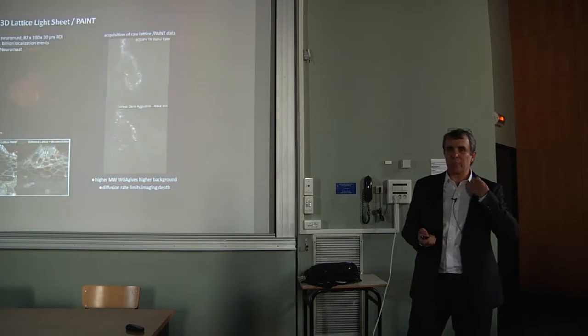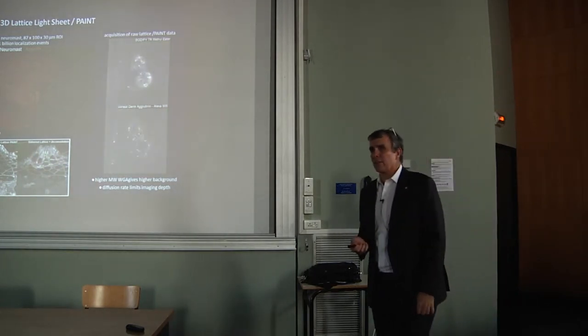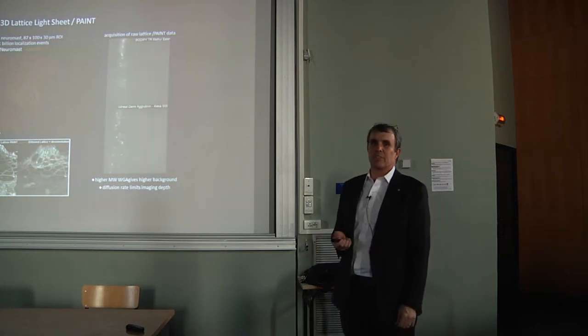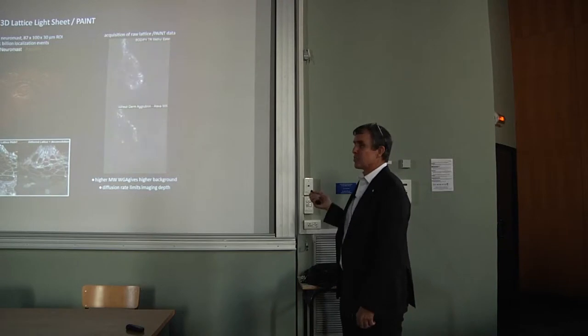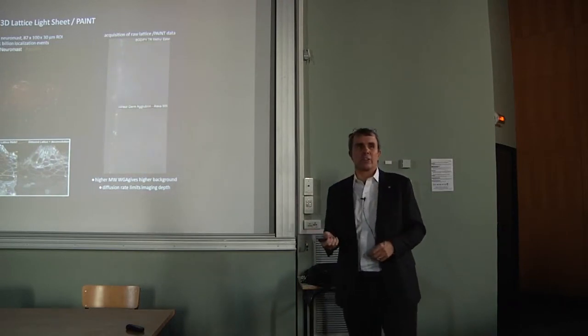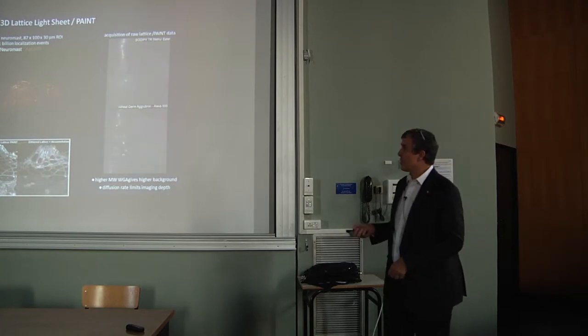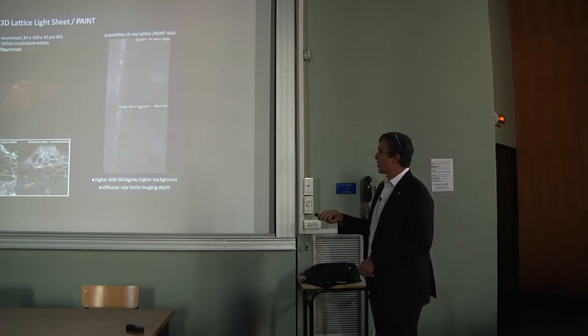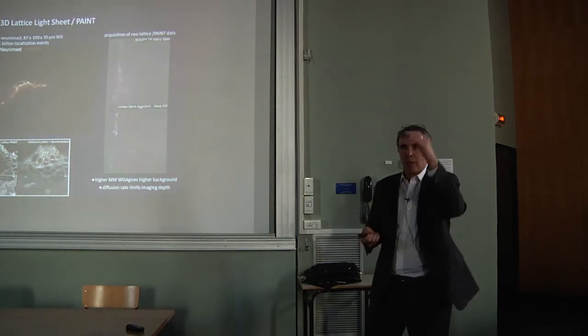In this case, it's about 1 billion localization events. So one thing PAINT is not is fast. So to localize 1 billion molecules took 10 continuous days of imaging in the microscope. And yet we still can register every molecule relative to one another over those 10 days to a precision of better than 10 nanometers.